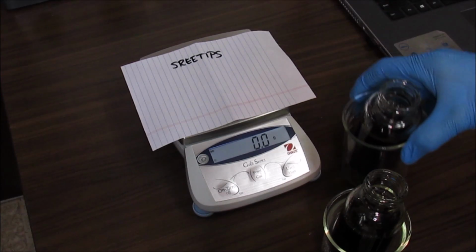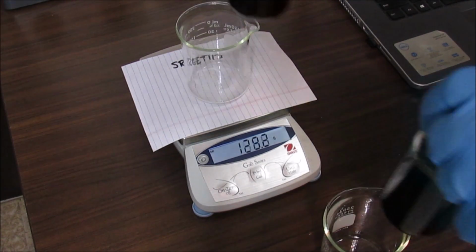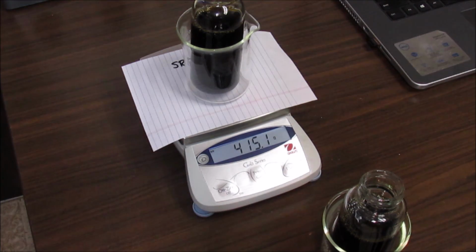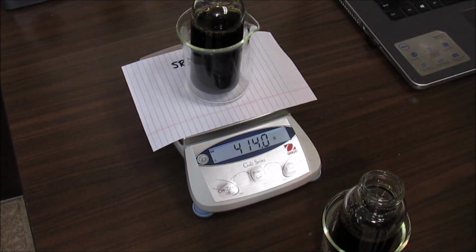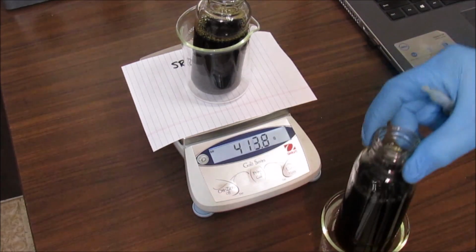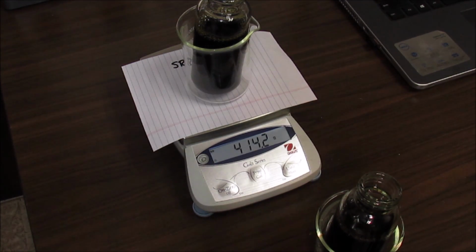Well, I'll balance these out now. I got 413.3 on that one. This is 415, so I'm going to take about 1 ml out of here. Alright, we got 414.0. 414.2. That's close enough. It needs to be 1/2 gram. It's less than 1/4. So we're good.